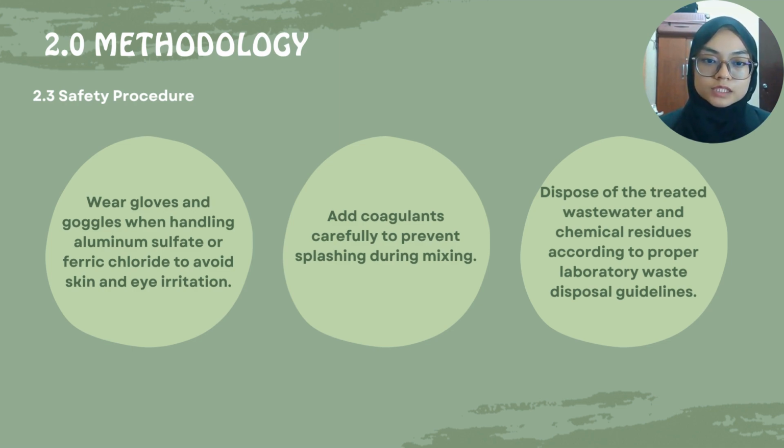And the third one is to dispose of the treated wastewater and the chemical residues according to the proper laboratory waste disposal guidelines. We also need to be very careful when cleaning the beaker, to avoid any beaker crack that may cause bleeding to our hands.